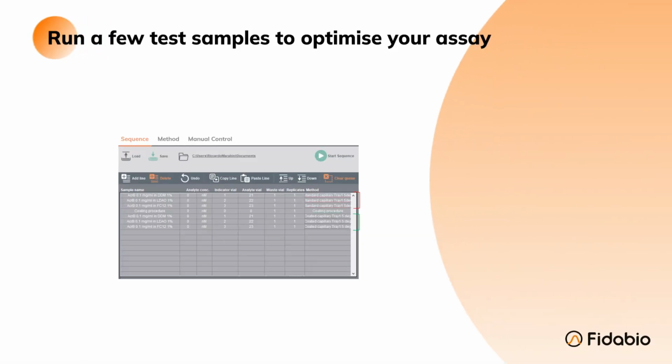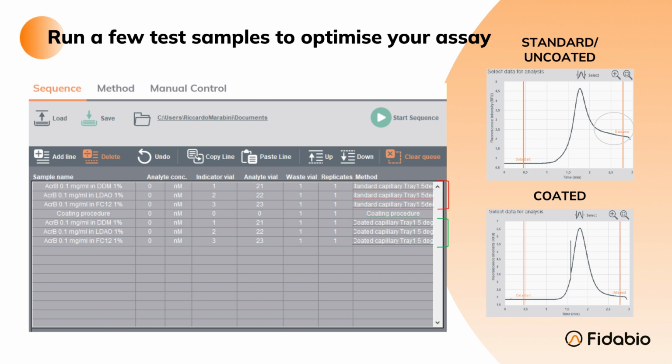To avoid wasting time and precious sample, it is useful to test 2-3 detergents with standard or coated capillary. Here we have a sequence with 3 different detergents running in standard capillaries, marked in red, followed by the coating procedure, and we rerun the exact same samples using the coated capillary marked in green.